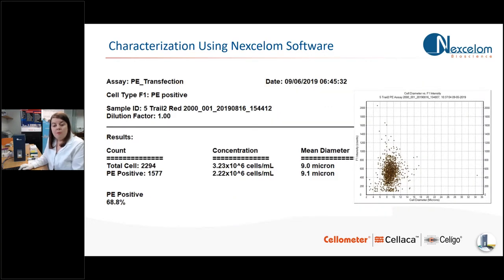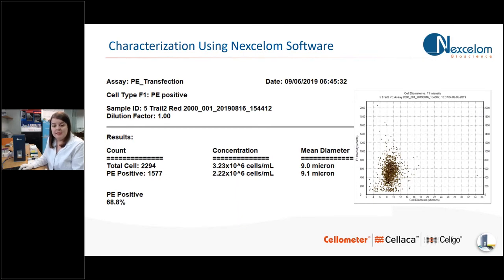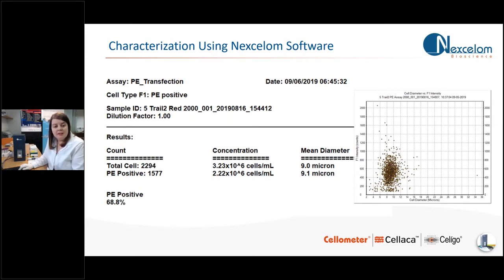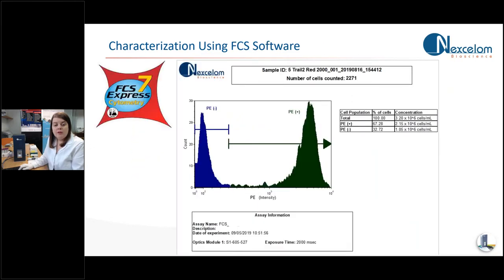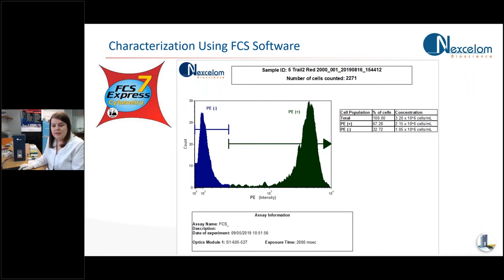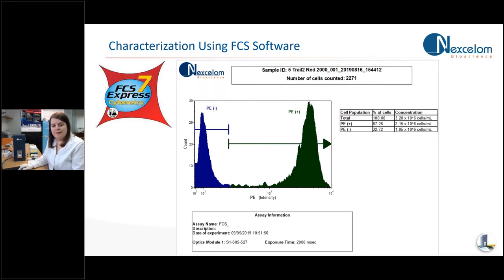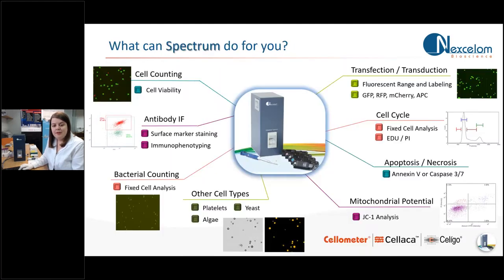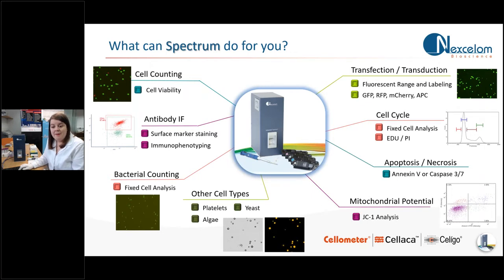You can also perform population analysis and you can do this within the software. This is an example of a test for PE transfection efficiency. Results are presented like this within the software. But what you can also do is you can seamlessly export that data into FCS Express to do further and more complex analysis. And this is something I will show you with some examples today.